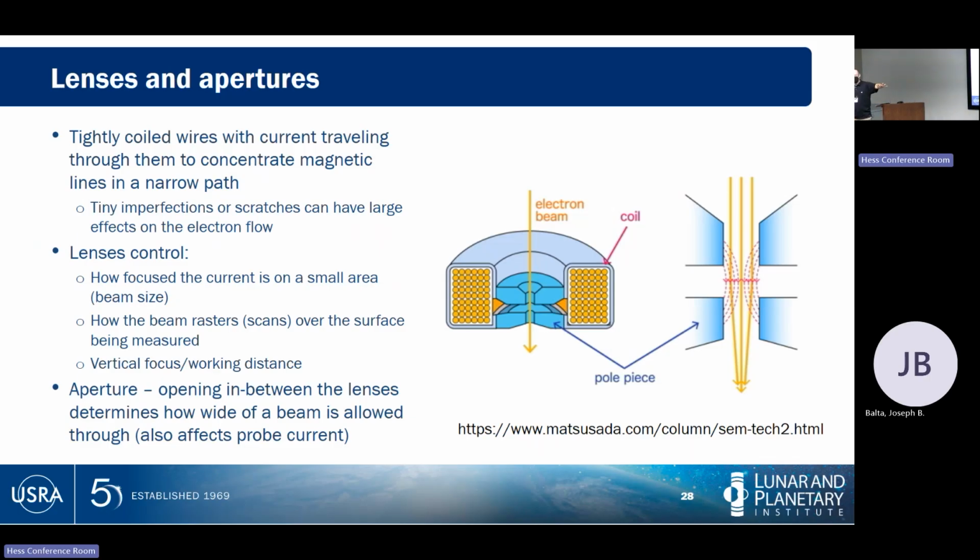Over time, let's say that we build our electron microscope. Nobody's typically going in and touching these things on an ordinary Tuesday, but let's imagine a little bit of dust comes off. If a little bit of dust gets on here, or a little bit of stuff vaporizes and precipitates on here, then that will affect the magnetic field generated at this spot. You will need a way to adjust for that in a second.